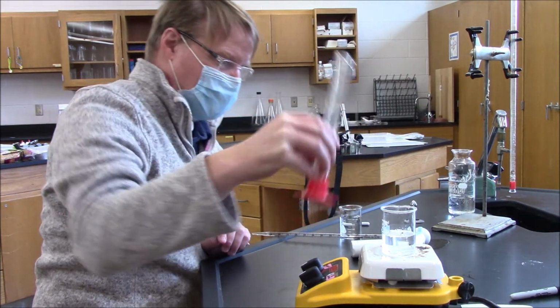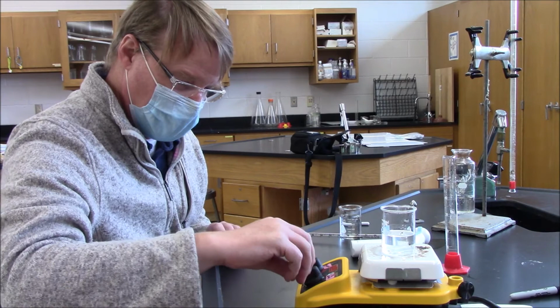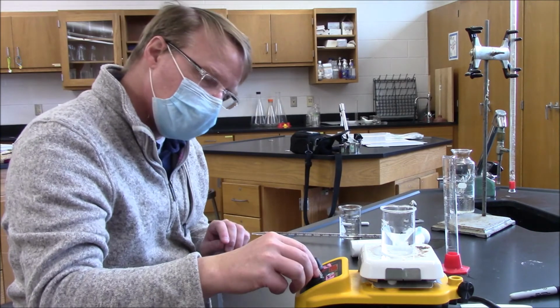Okay. All right, now the right-hand knob on the yellow hot plate is stir. You can turn that on. Does it matter how far I turn it on? Just turn it to the middle. But no, it doesn't really matter. There you go. Maybe a little less. Maybe that's a little aggressive.